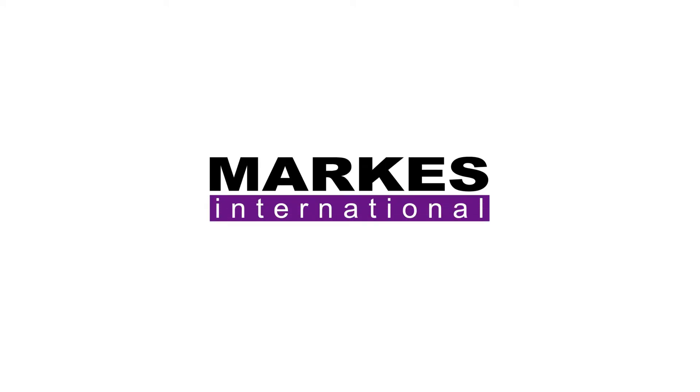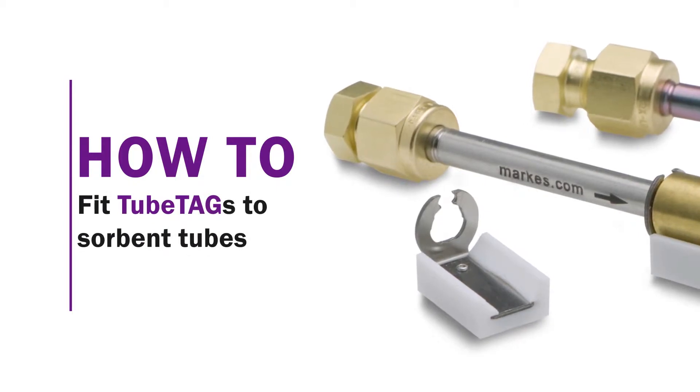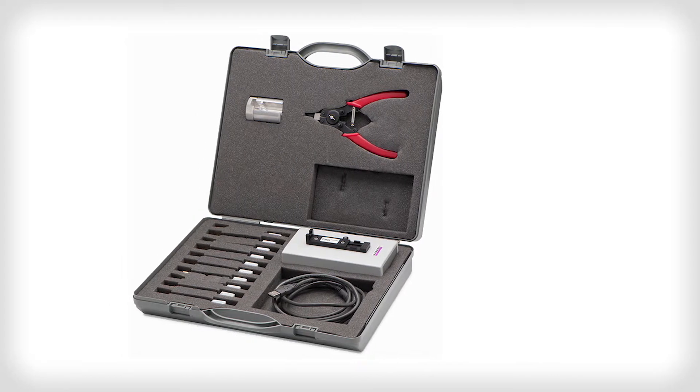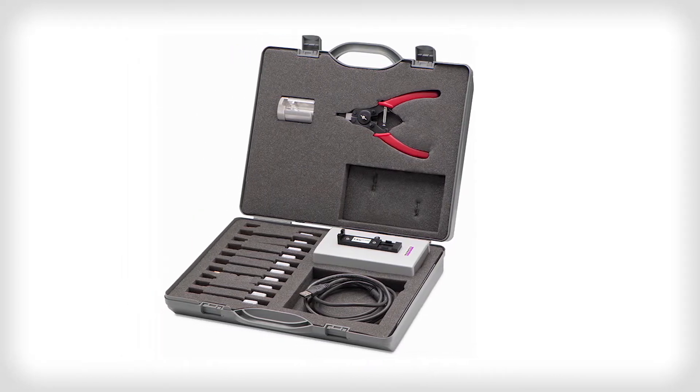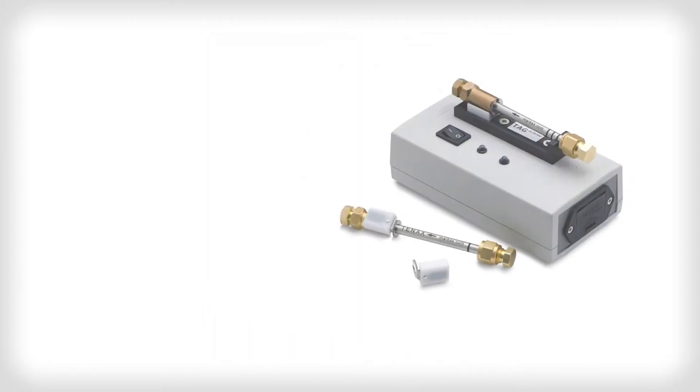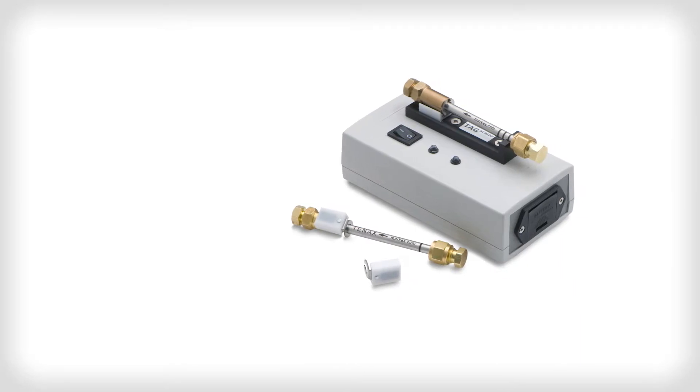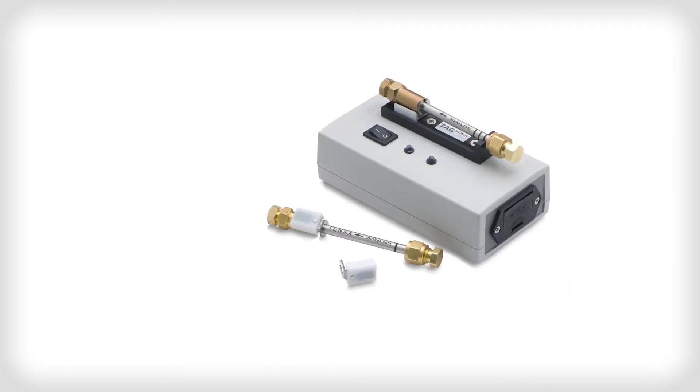The following video will show you how to fit TubeTag's sorbent tubes for information handling. TubeTag is a robust radio frequency identification tag that clips securely onto stainless steel or glass tubes and eliminates transcription errors. It allows for a chain of custody through field monitoring and lab analysis.